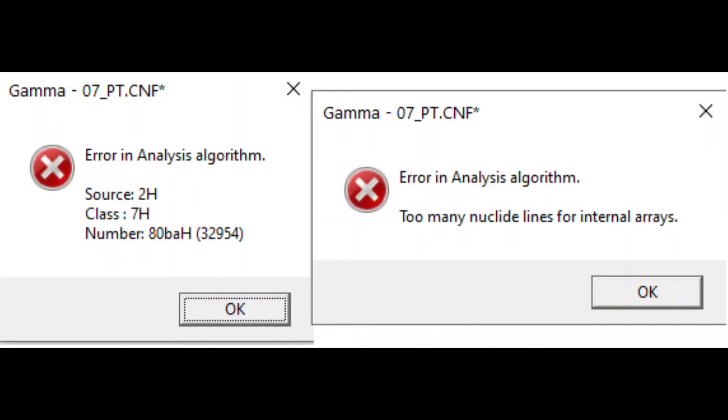Now, there are two possible error messages that may arise when you enter too many nuclides into step four of the analysis process. The first being the too many nuclide lines for internal array error message. The second is the enigmatic ATBAH32954 error.